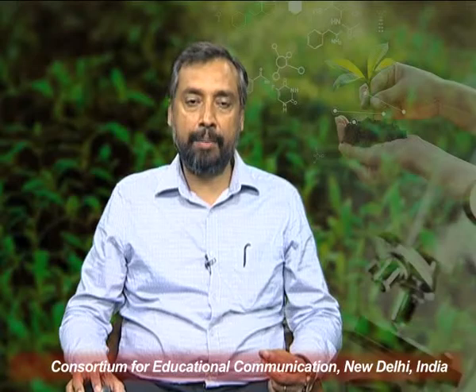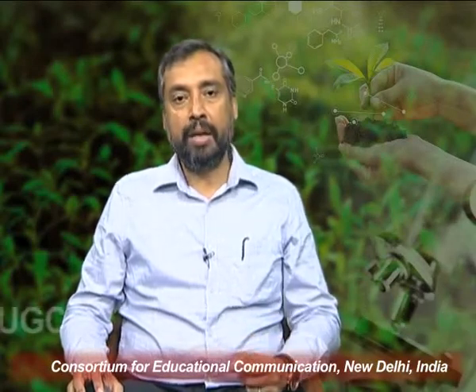The last component happens to be the objective lens. This component is responsible for producing the magnified image and can be the most expensive component of the microscope. Objectives are available in many different varieties, with much information inscribed on each one.